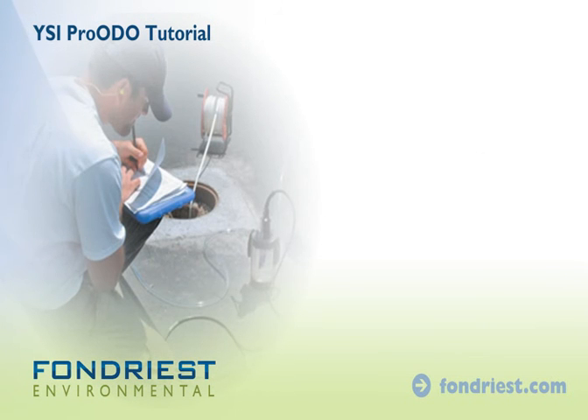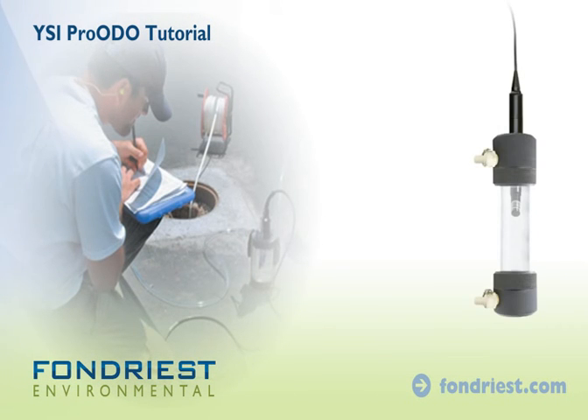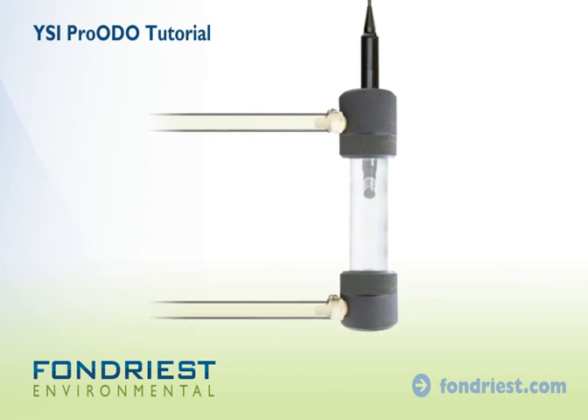For pumped groundwater applications, install the flow cell to the sensor bulkhead and connect pump tubing. As water flows through the cell, allow time for the sensor to equilibrate before logging data.